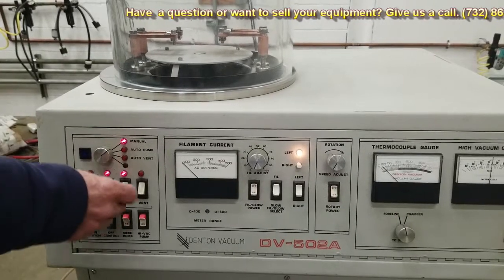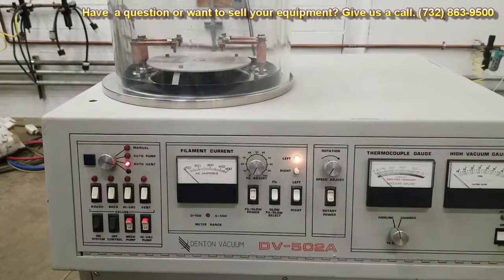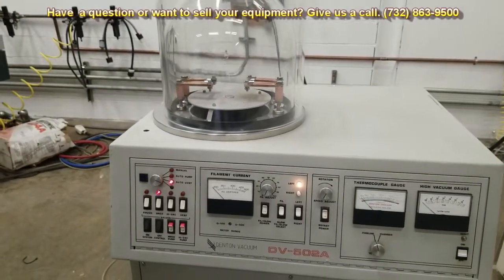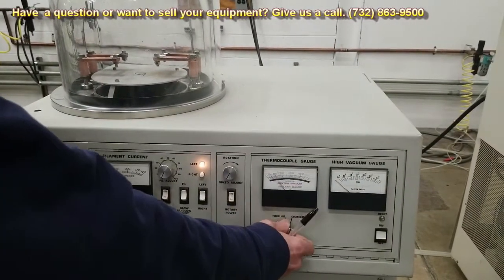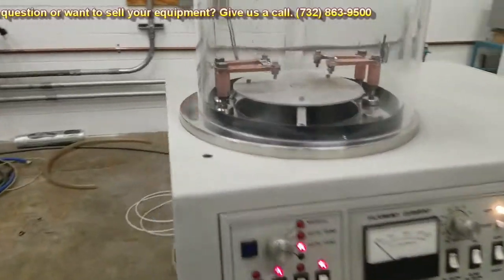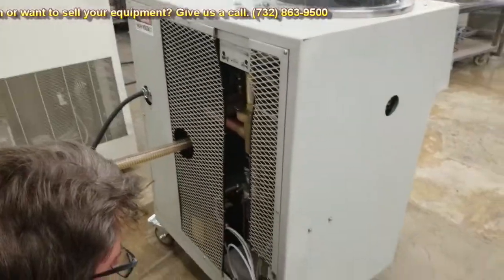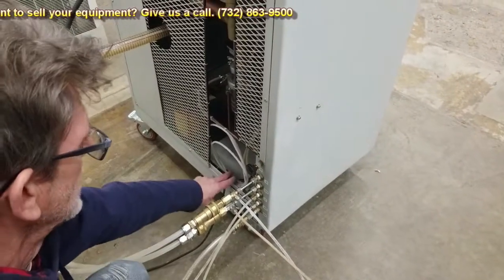At this point I'm going to go ahead and do an auto vent. Now I'm going to look at the chamber. There is a vent line back here — you can attach that to a nitrogen cylinder. Right now it just opens up to air.